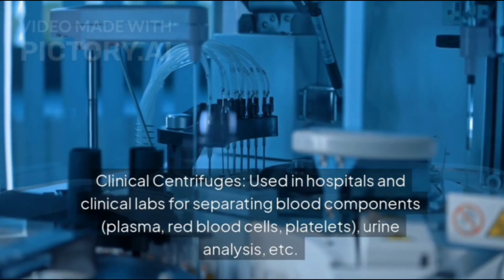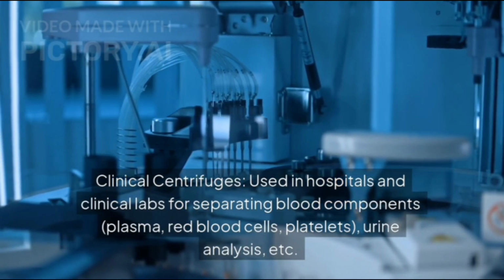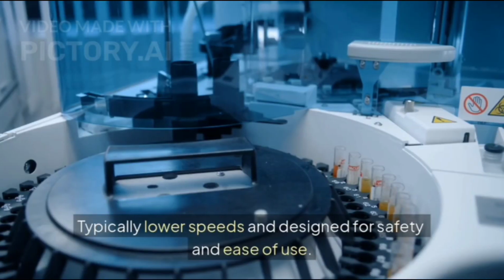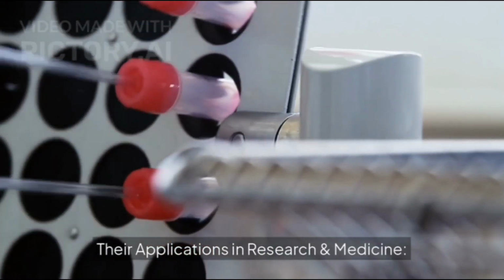Clinical centrifuges, used in hospitals and clinical labs for separating blood components, plasma, red blood cells, platelets, urine analysis, etc. Typically lower speeds and designed for safety and ease of use. Their applications in research and medicine.